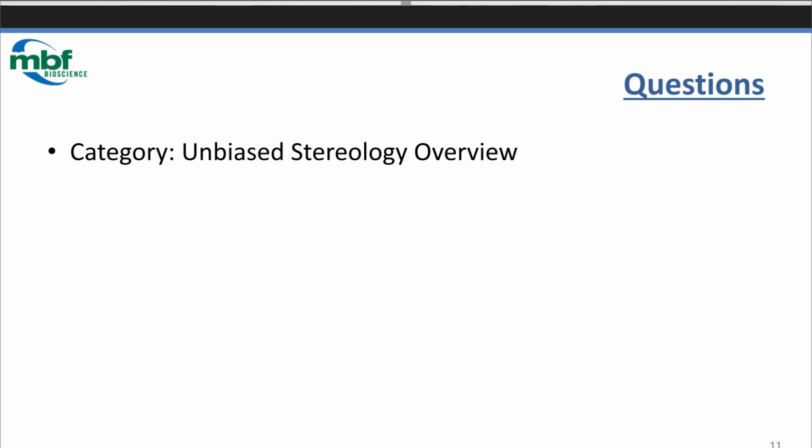There's a question about estimating volume. We will get to that in a future webinar. Okay, someone, Brady, has asked, I see people estimating the number of cells in the dentate gyrus, but by only assessing the first 5 slices of the hippocampus, is that not a biased approach? That is a biased approach. That will only tell you about the first 5 slices of your region.